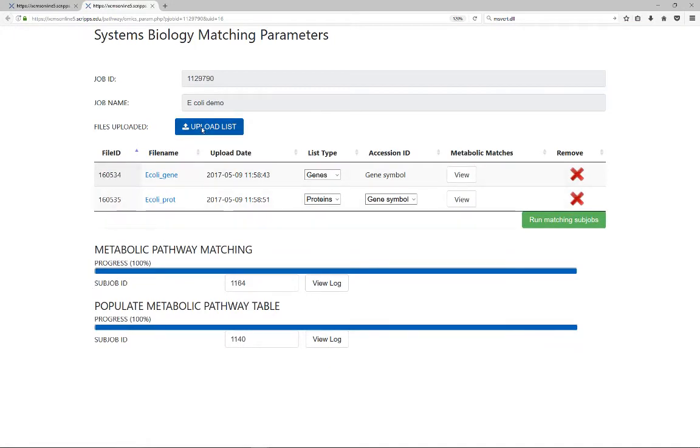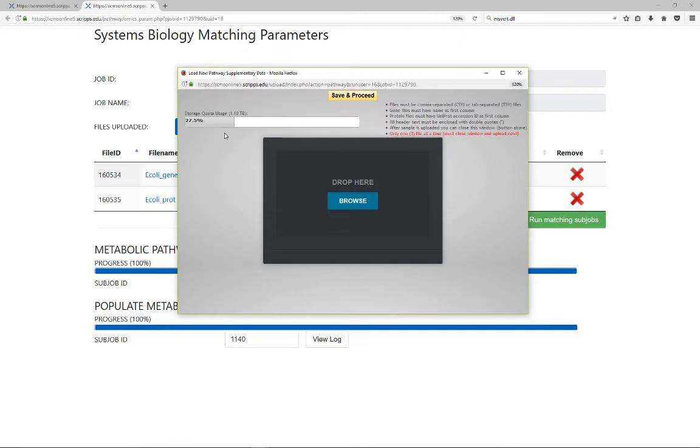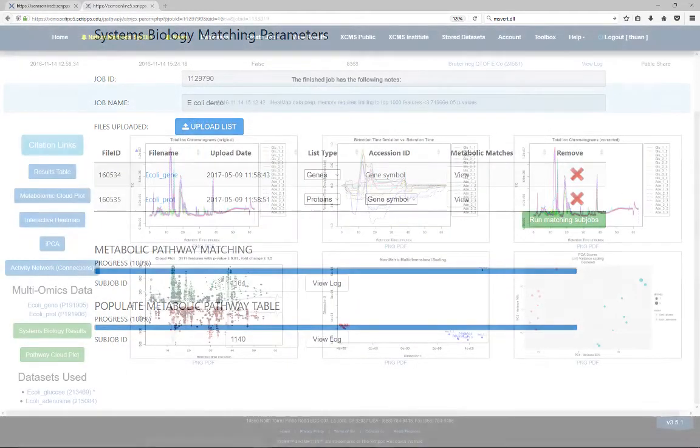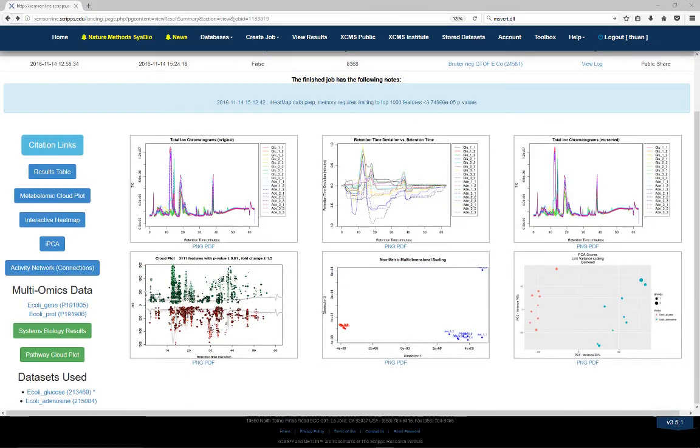If future jobs on newly acquired omics data needs to be run, this process can be repeated by uploading additional files and running another subjob.